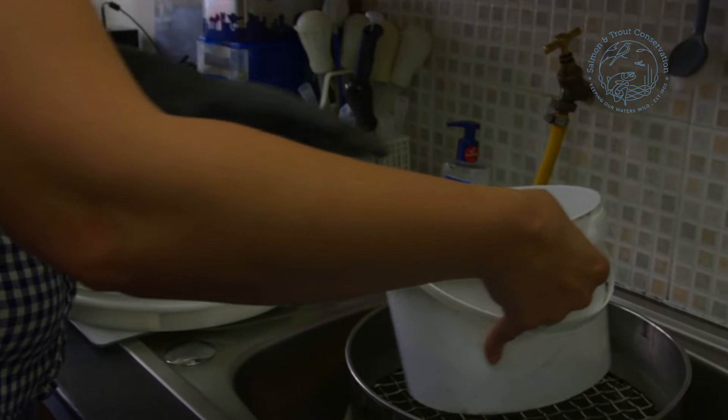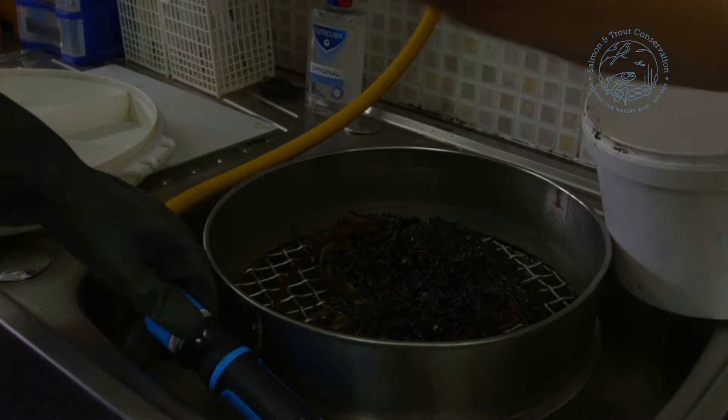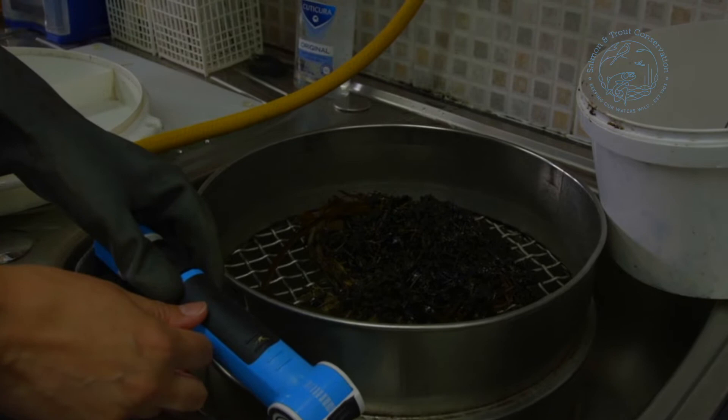First things first, we just pour the sample into the sieve. Once we've made sure that we've got most of the sample out, we're going to use the water to rinse out the bucket and then rinse through the sample, making sure that we've rinsed all the different parts to get out as many animals as possible. We really don't want to miss anything.